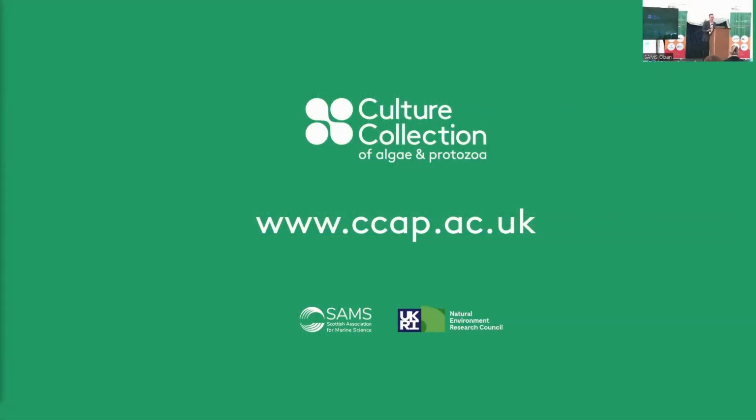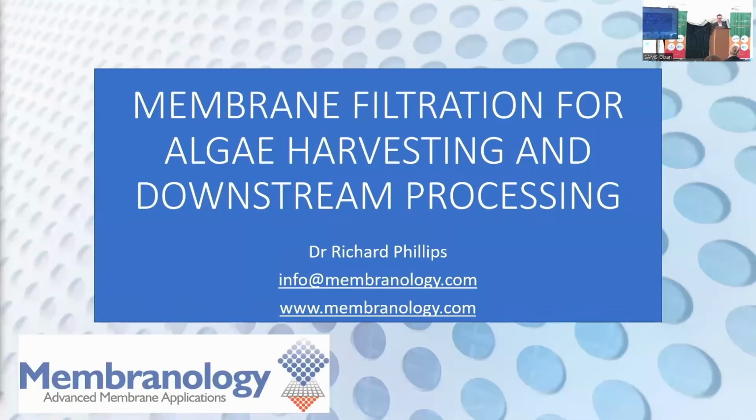Okay, so next, Dr. Richard Phillips from Membranology. So again, the membrane harvesting system. If you've seen, the algae reactors contain a lot of water, and we have to separate the algae from the water. You can do it through various methods, but the Membranology system is the option that we went for with this system. So Richard will explain his company and the products that he has there.